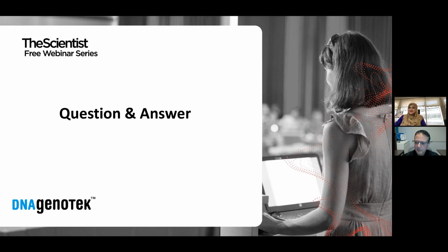Let's see. A question for Mike. Actually, there's quite a few questions for Mike. We can start with the first one. How does eating prior to saliva sample collection affect DNA yield? That's a good question. So really what happens when someone eats is that the act of eating clears free saliva out of the mouth.